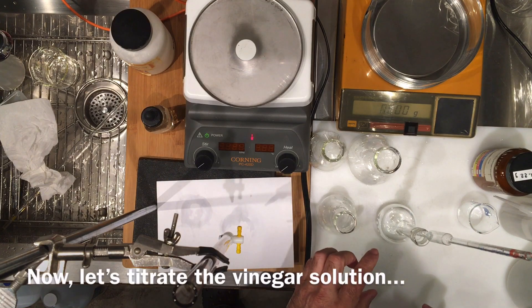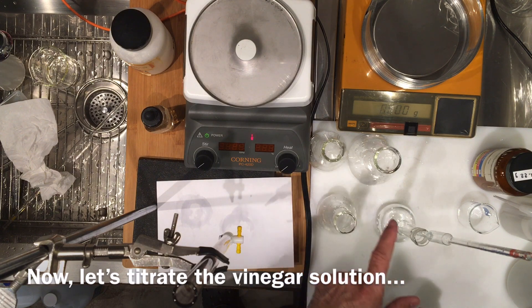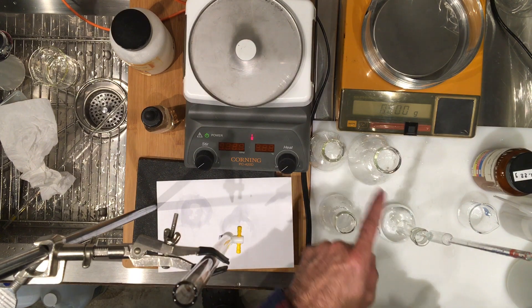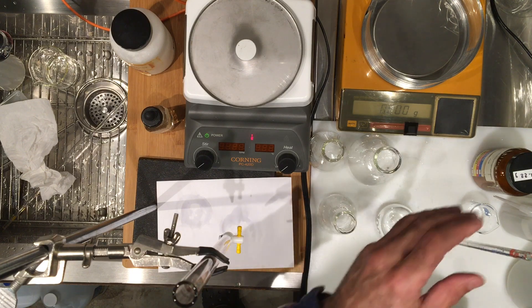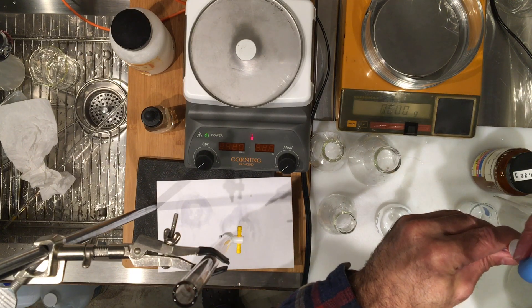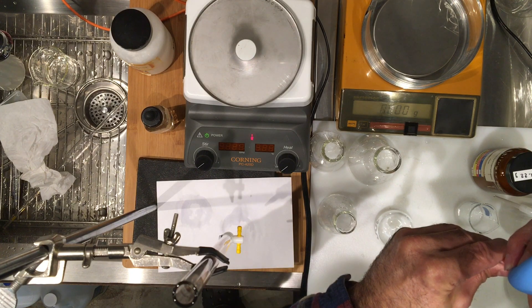I'm going to transfer three portions — two already done — of 10 milliliters of diluted vinegar into these flasks and then do a titration with our standardized sodium hydroxide. I've already transferred two 10 mL portions but I wanted to do the last 10 mL with you so you can see the process.